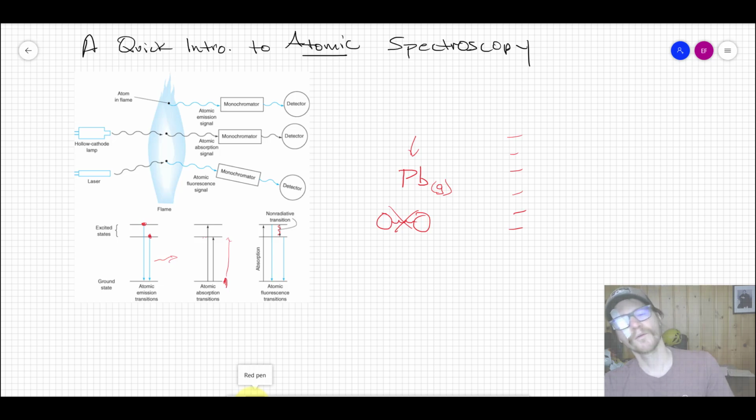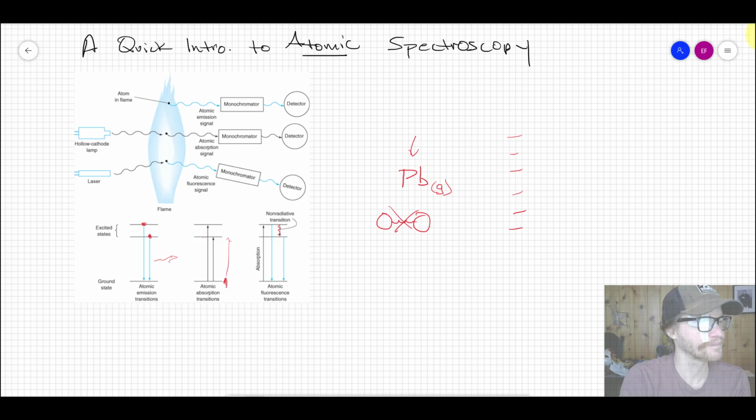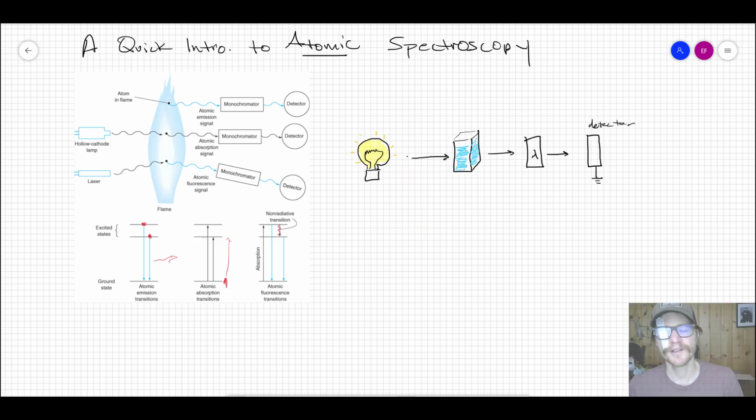So what changes about the molecular geometry? Well, only really one thing. The geometry is really the same, or at least it draws significant parallels to a normal spectrophotometer, the molecular spectroscopy geometry that we talked about before, where we have some sort of light source, some sort of sample introduction method, some sort of wavelength selector, and some sort of detector in a geometry that looks comparable to this. There are a couple of things that change here though.